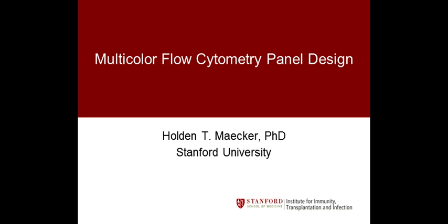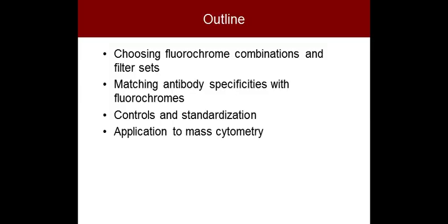Unfortunately, a flow cytometer doesn't work that way, and there are differences in the fluorochromes, in the cytometers themselves and their capabilities, and so the design of panels in flow cytometry has become a little bit of an art, and that's the art that I'm going to hopefully share with you today.